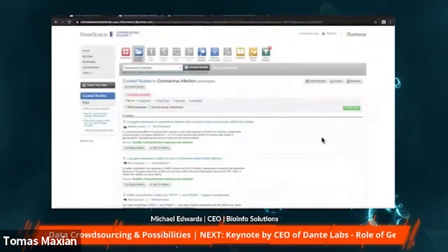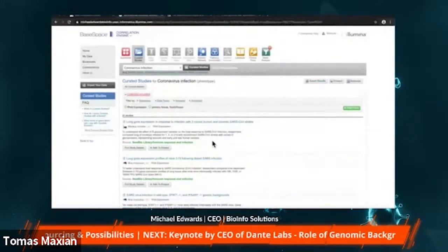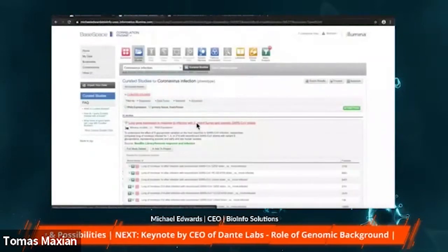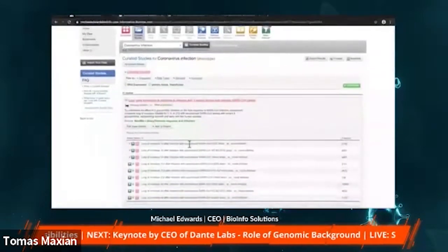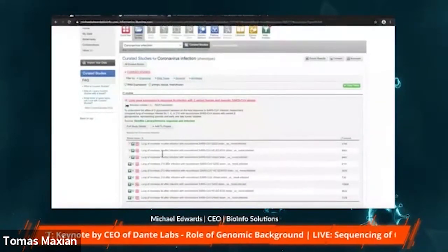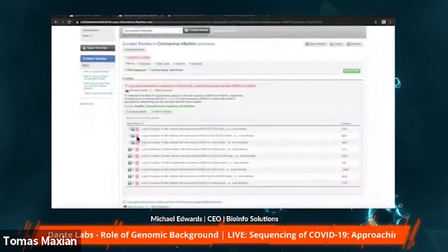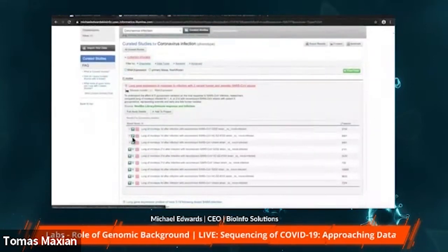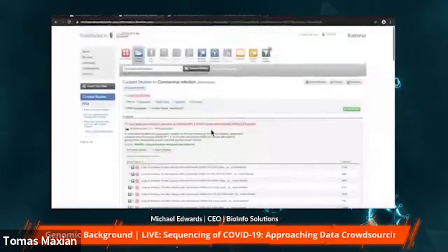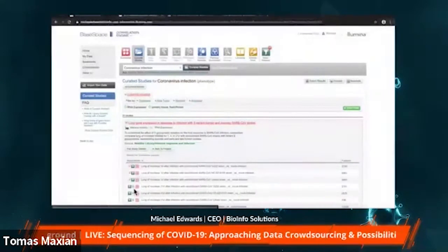We can click on these entries to see if any of their biosets or comparisons used in these studies match our criteria. In this first study, we can see that this group challenged monkeys to different strains of the SARS-CoV virus. We can then choose to include those biosets that examine the lung response to the virus at day 1 of infection. So these first 3 up here. By clicking on the plus sign to the left of these biosets, I can include this in my meta-analysis, and they will show up in my meta-analysis app after I choose them.